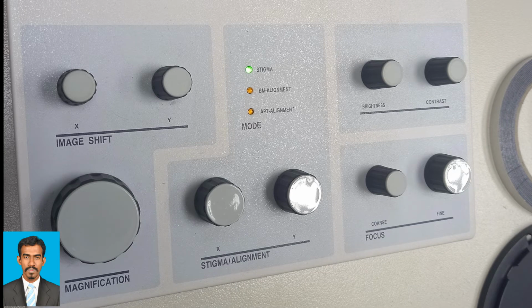Magnification is a function of area scanned and viewed. Two controllers adjust the magnification: the raster coils, and the location of the focal point of the primary beam to the final lens. So these are the two ways the magnification is adjusted. And then we have the focus from coarse to fine. There are two knobs, one for coarse focus and the other for fine focus.